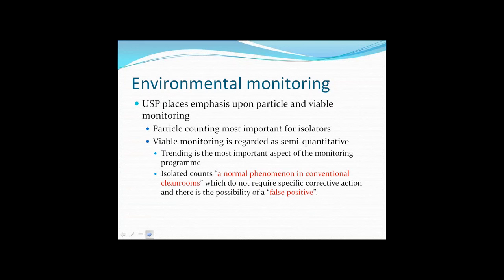Now, personally, I'm not sure that the term false positives is the best one, because although, yes, it is something that may have come from the person intervening rather than from a HVAC system breakdown, this shouldn't negate the importance of that and the potential risk of microbial contamination occurring should, for example, that have occurred within the vicinity of a product sample or open vial or something similar.